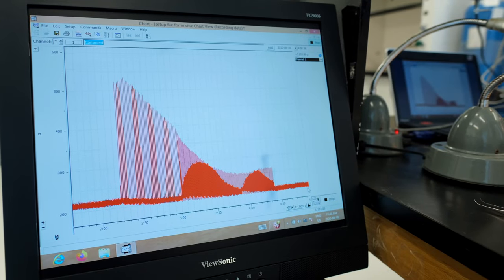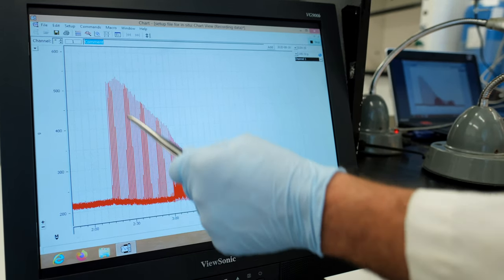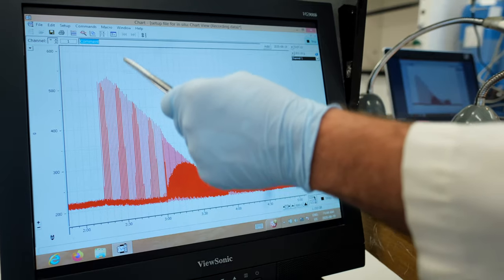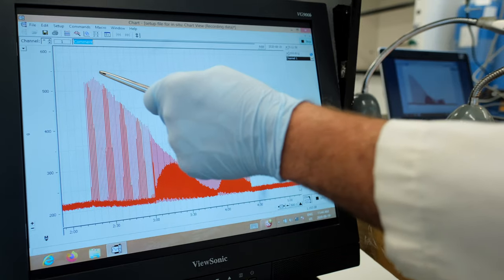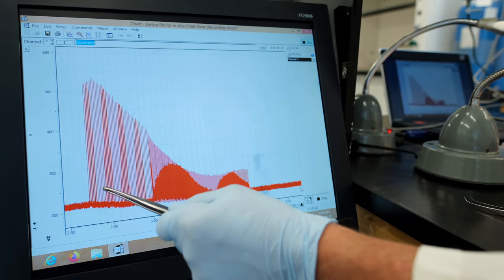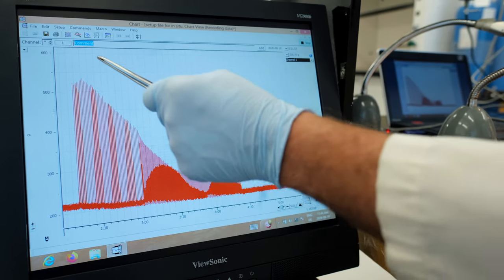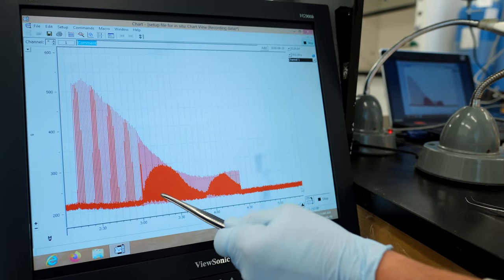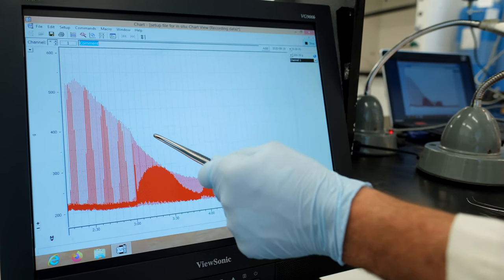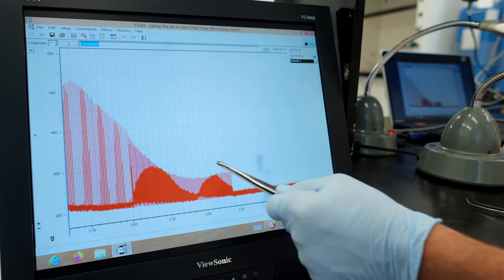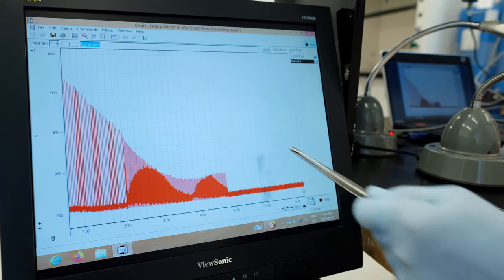The result of that stimulation is shown here. You can see the muscle contracting at full force on the left-hand side — these are tetanic contractions, the summation of individual stimuli giving us the maximum force output of the gastrocnemius muscle. Because we're stimulating at one tetanic contraction per second, there's a loss of force — that's fatigue. When we increase the workload to two tetanic contractions per second, that increased workload results in even greater loss of force, coming to a steady state before we stop the stimulation to allow the muscle to recover.